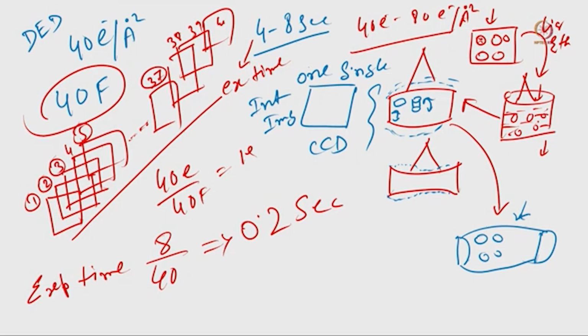Now, as I mentioned, we are collecting a single frame, that is frame number 1, and then there is some kind of movement. If I consider this is my frame number 2, here this is the movement, you can consider this is a difference. Then in the third frame there is more movement. So something like that, this is the difference between the first frame, second frame, third frame.